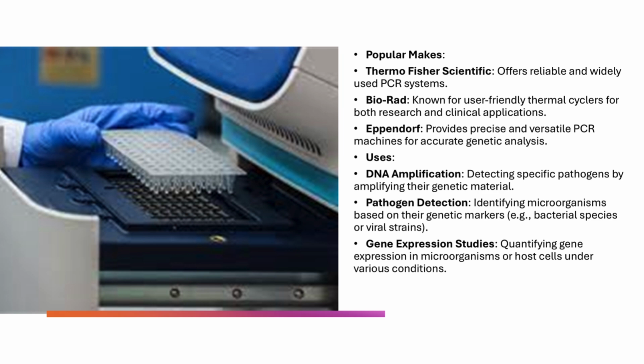Gene expression studies. PCR machines also play a key role in gene expression studies, where they can be used to measure how genes are expressed in microorganisms or host cells. This is essential for understanding how organisms respond to different environmental conditions or treatments.